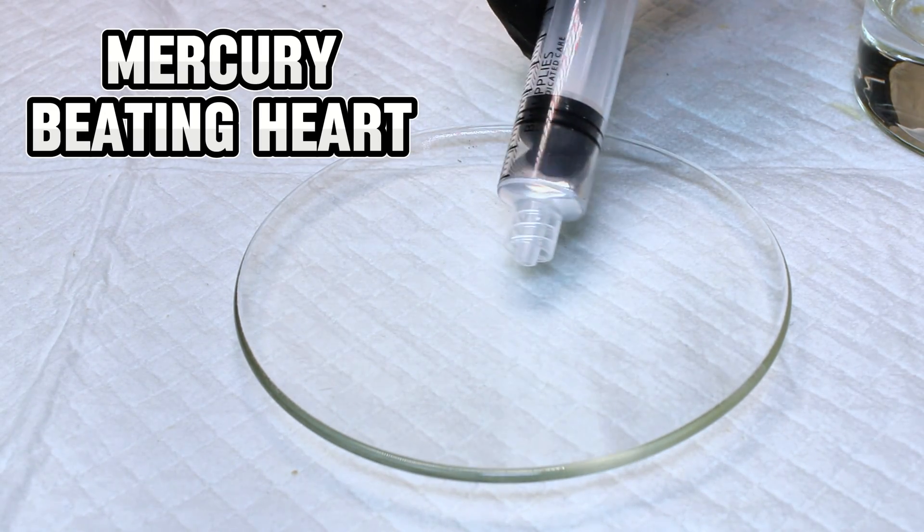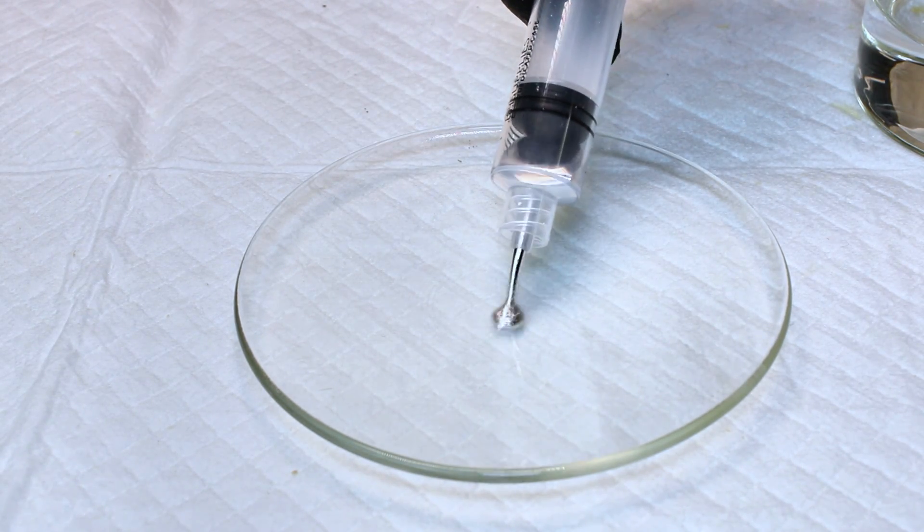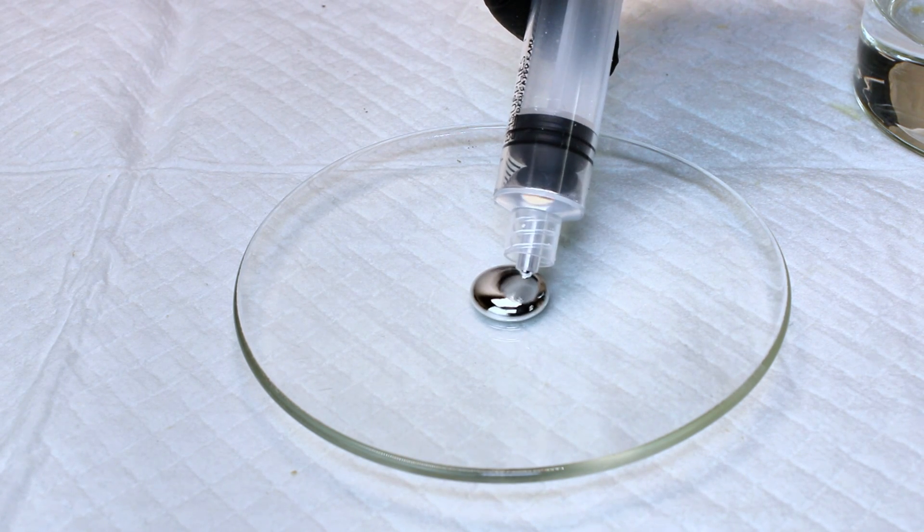Today I'm going to show you the mercury beating heart, which is one of the very few known oscillating chemical reactions.